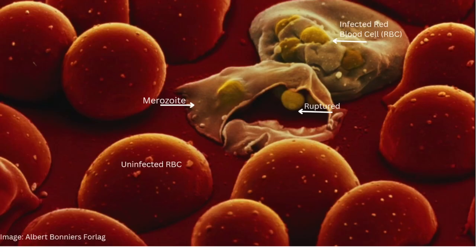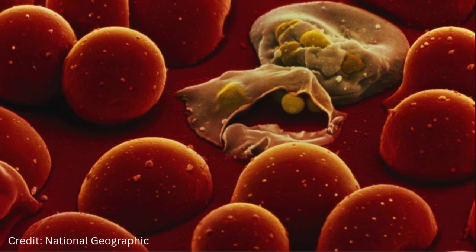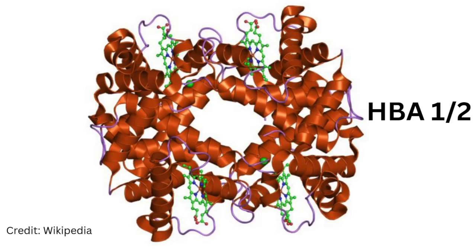However, like I said, if you have blood in the system, then you're going to also have globin messenger RNAs. And this is where you will have probes that target those globin messenger RNAs and eliminate them, so that you really only have messenger RNAs related to the system that you're studying.